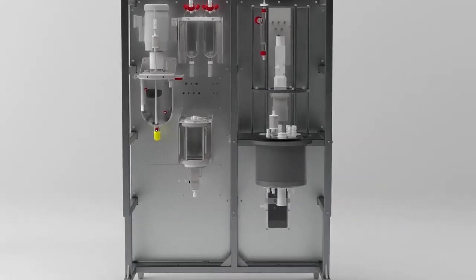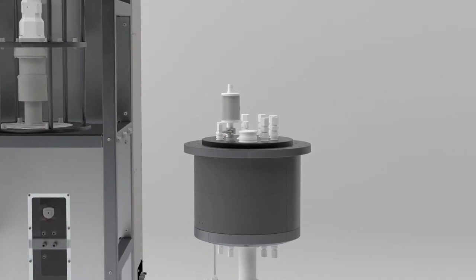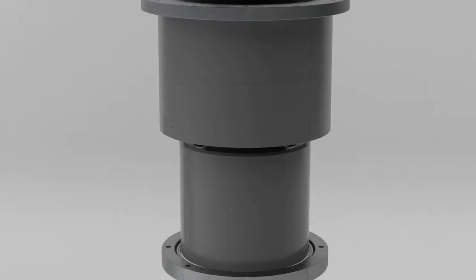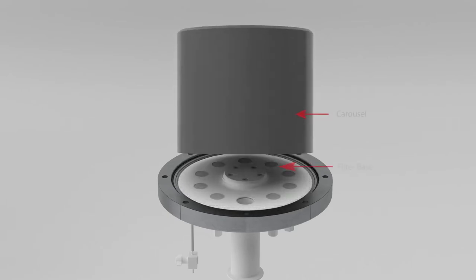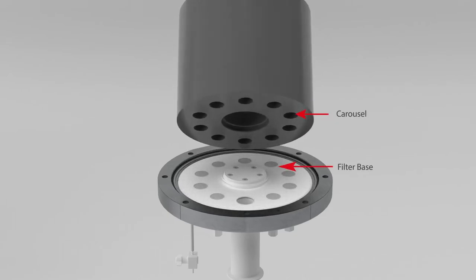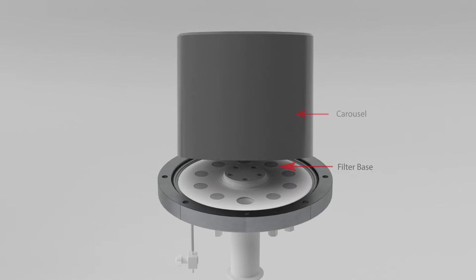The carousel is a series of hollow cylinders moved around a central axis to fixed processing stations. The carousel rotates across a filter base composed of a smooth surface with static filter plates recessed at a depth of 0.1mm.